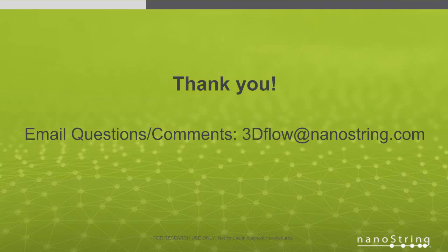Yeah. So we have done that. There was a heat map I showed in the talk where the sorted populations, which are obviously positive for the markers that we're interested in sorting on, also show up positive with the NanoString data. So we have those easy and obvious comparisons. We also look at mean fluorescence intensity for the populations that we're sorting, partly to make sure that our antibodies are not interfering, as we talked about before. So I guess those are the two main places where we've done direct comparisons of the flow sorting data with the NanoString data.